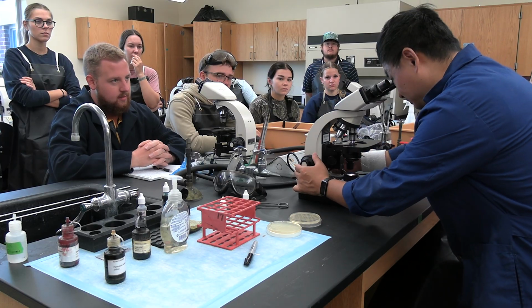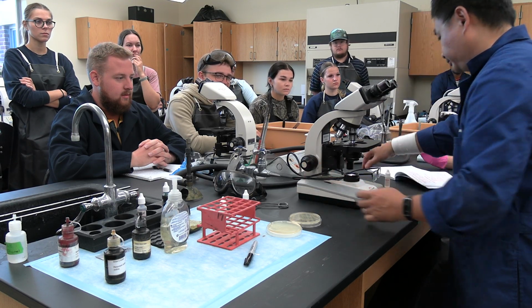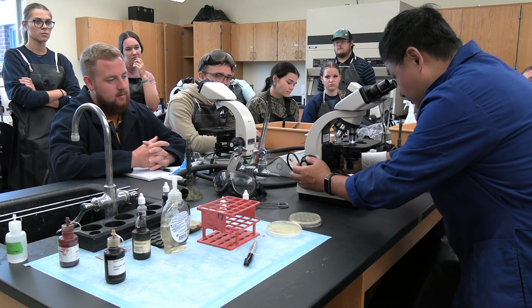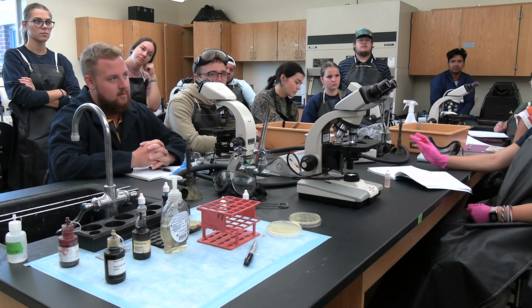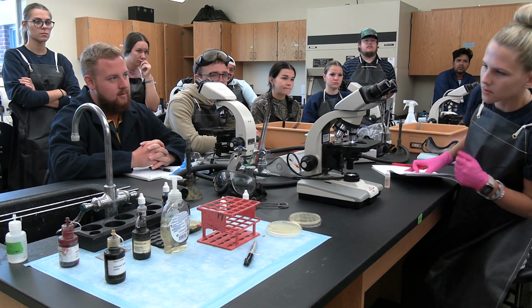So we go here, oh, it looks fine. Make sure the iris diaphragm is at 100. Go ahead and see it. That's on the 100x. It looks gram positive, and the chain shape. Go ahead and look at that.